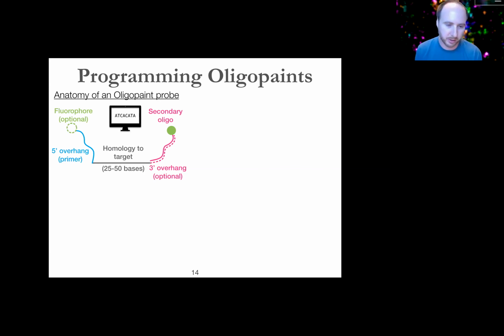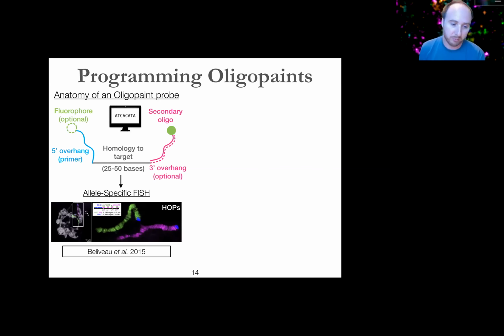This is work from us and others that have done all of this. One set of work from Ting's lab when I was there was to develop allele-specific DNA FISH that scaled to non-repetitive regions. So here we can target a pair of probes that are differentially labeled with single nucleotide information when we have phased variants along the different haplotypes and get allele-specific labeling, which is pretty fun.